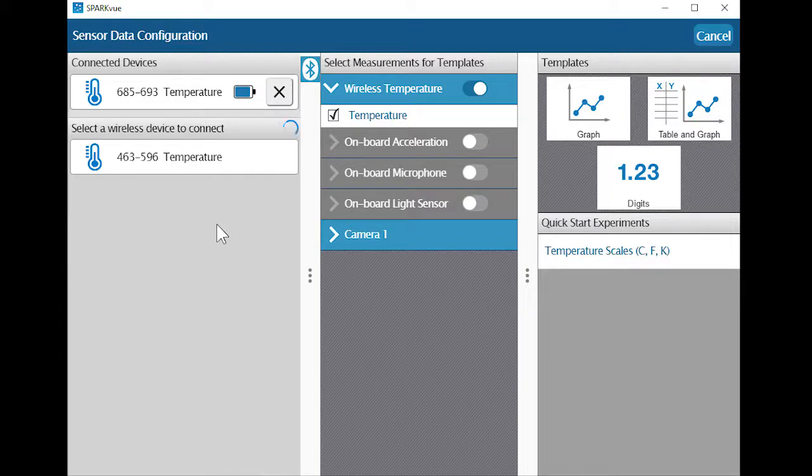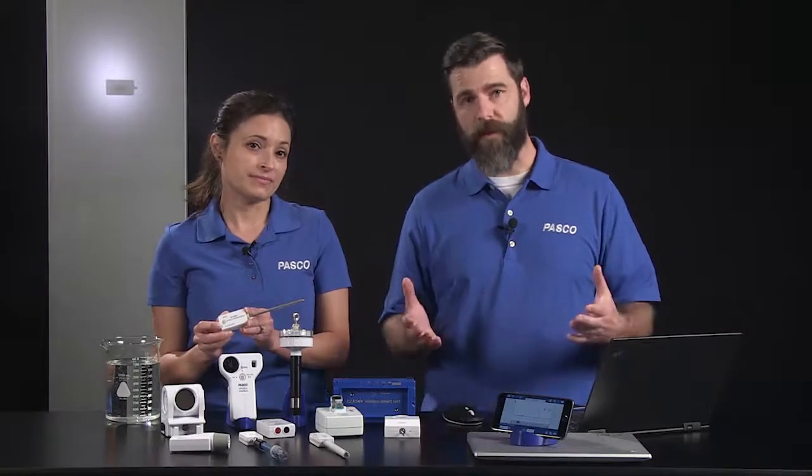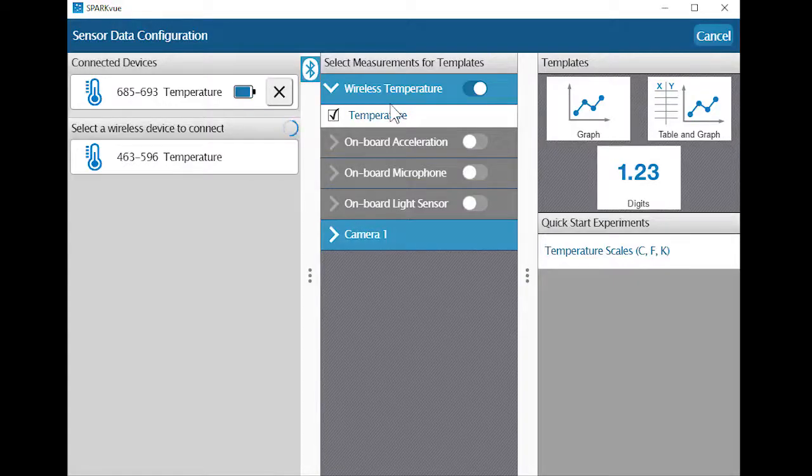I can see the connected temperature sensor's measurement in the center panel. If you've connected more than one sensor or a sensor with more than one measurement, such as a smart cart or a weather sensor, check only the measurements you want to display.